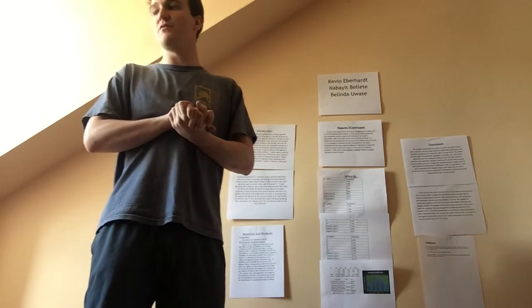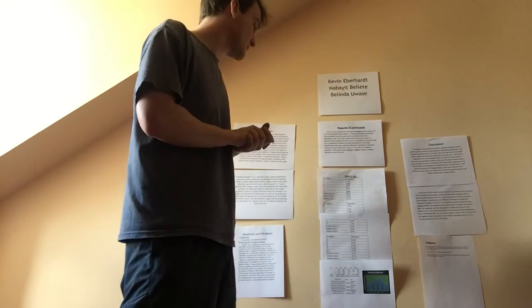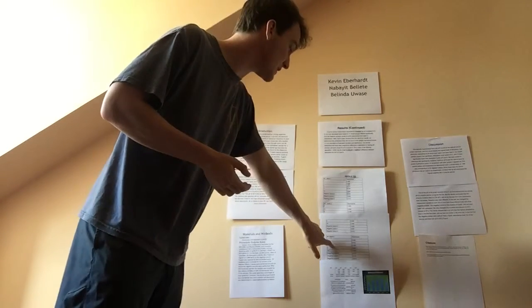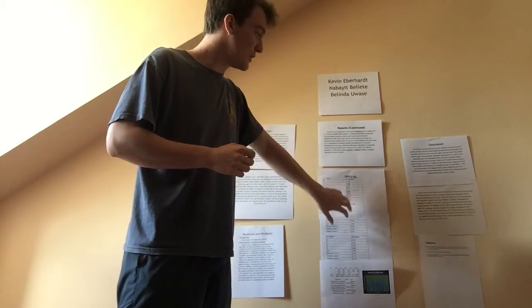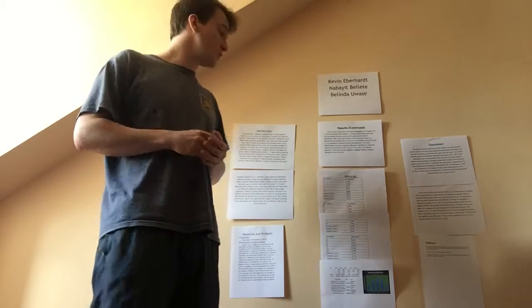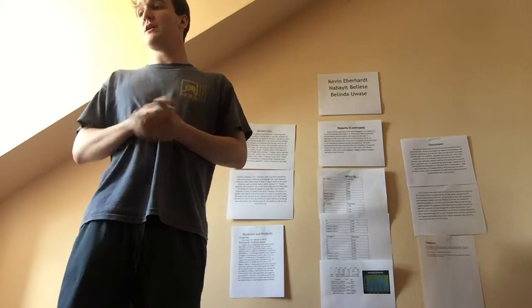So potential sources of variability here are user error and different things like that. Clearly we had some sort of error here with our pH 9 batch. So in future experiments, we would try to be a little more careful with that and make sure that we had 3 different results. And in a future experiment with more time and more resources, we would probably want to test an even higher number of repetitions than just 3. That's tough to do within lab time, but if we could do that, that would be great.